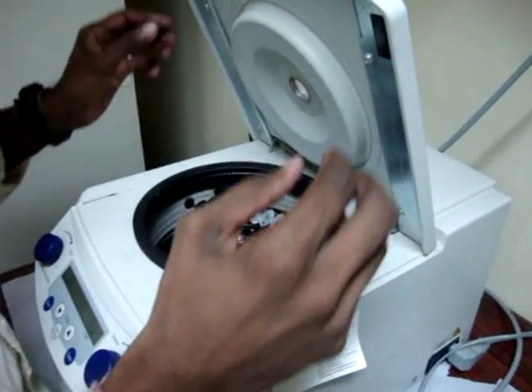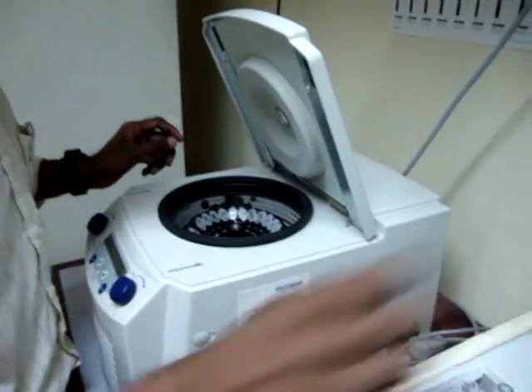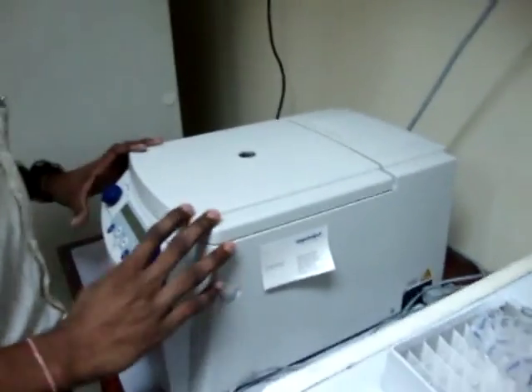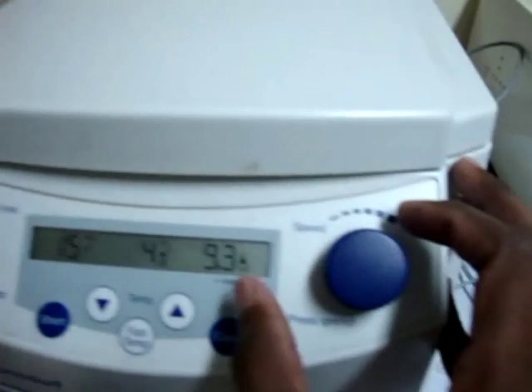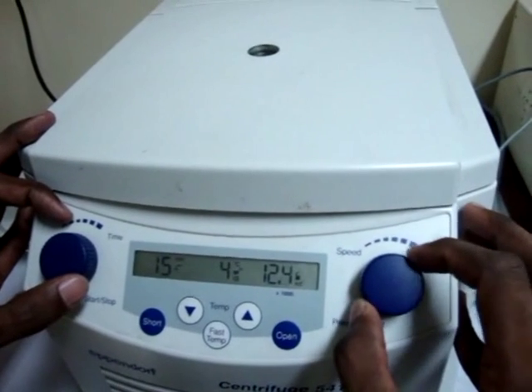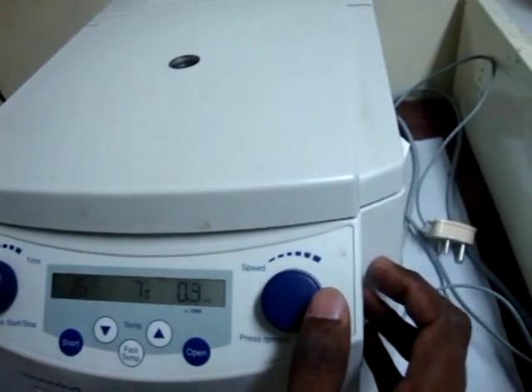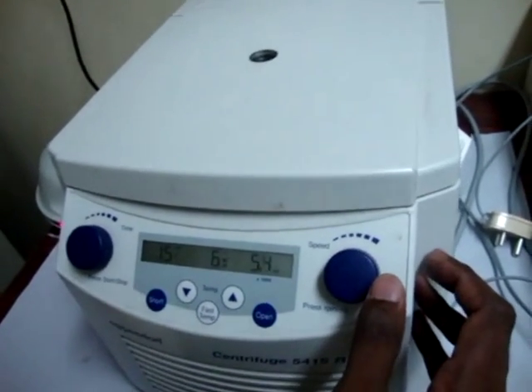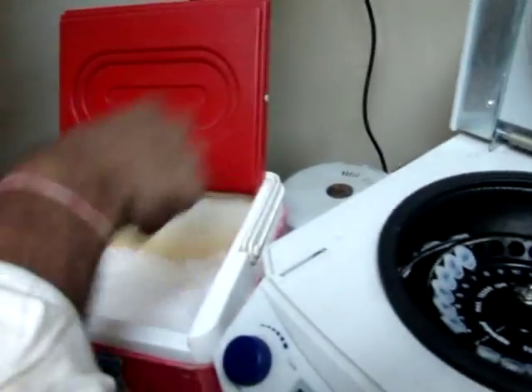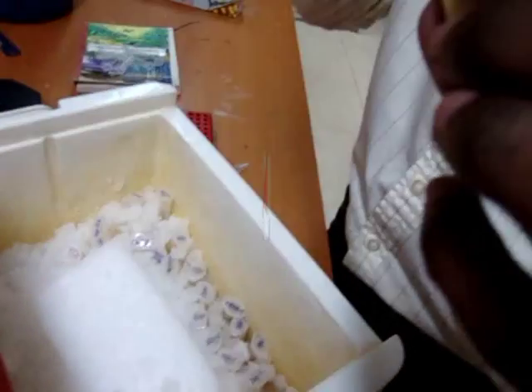The mixture was centrifuged at 12,000 rpm for 15 minutes in a refrigerated centrifuge. The temperature of the centrifuge should be as low as 4 degrees Celsius. Since the proteins are of low molecular weight, they float in the top aqueous layer. Utmost care should be given while removing the aliquot from the centrifuge; the aqueous layer was separated and transferred into a new aliquot.